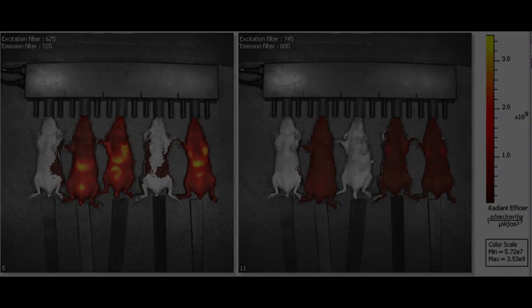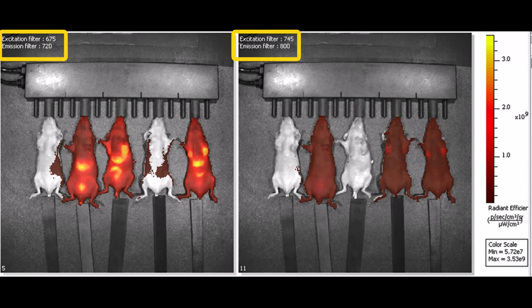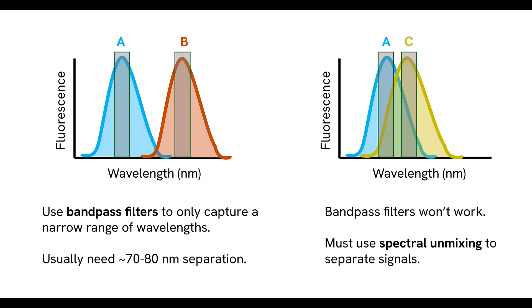We also demonstrated how to set up fluorescence experiments using the imaging wizard, how to image two probes in the same animal using different excitation and emission filter pairs for each probe, and how to check for crosstalk between the imaging channels.